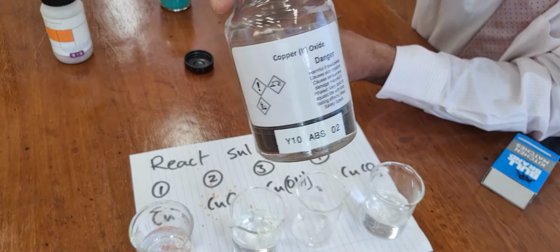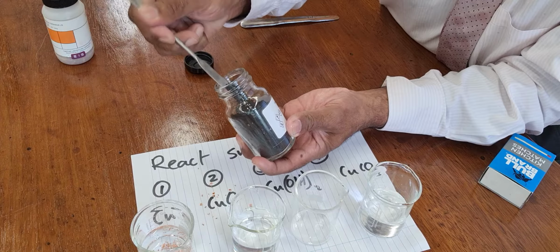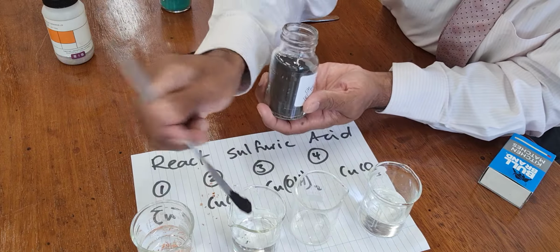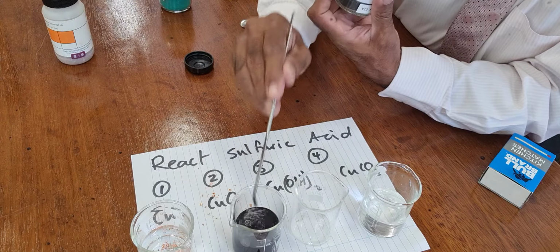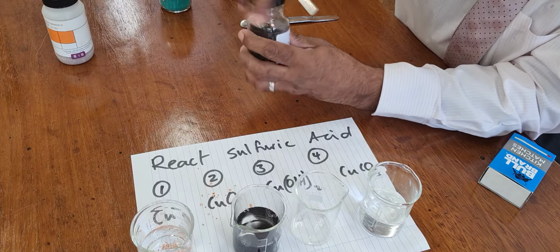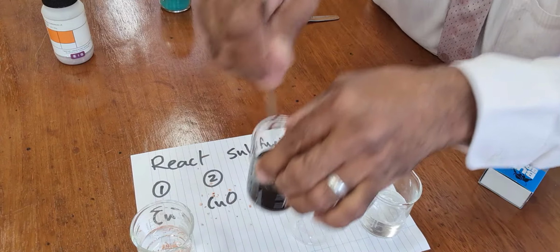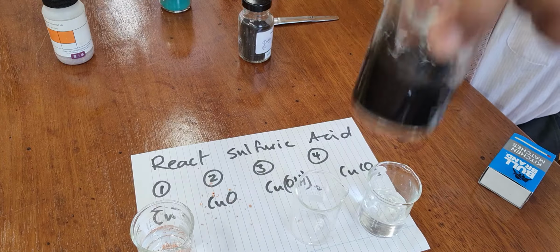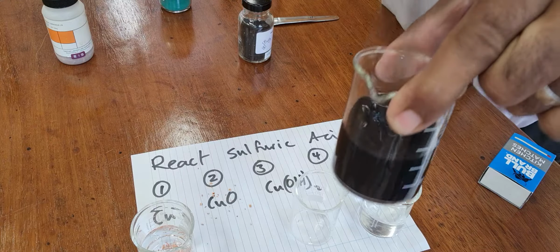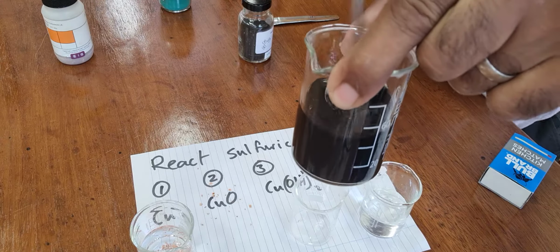Copper oxide, black powder. You should know by now it's a black powder. And there is a reaction. The black powder spreads out.